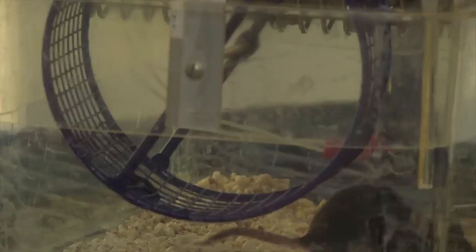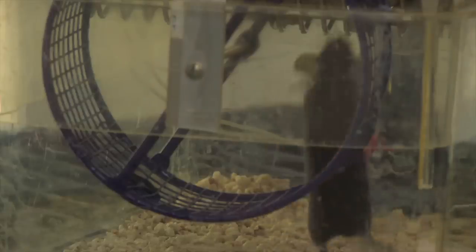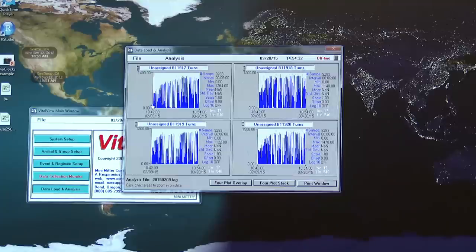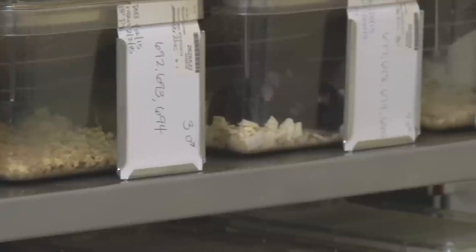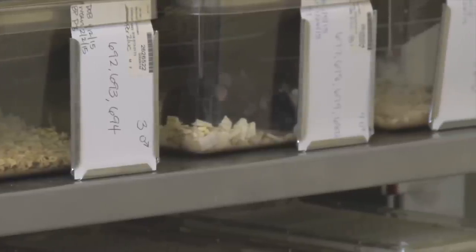It could also be that the mouse doesn't want to run for whatever reason, in which case sometimes very early in the experiment we can switch out a mouse, but generally it just means we might not include that mouse in our data. Additionally, a vet technician comes around every day to check the health and well-being of our animals, and we cage change the mice once every three weeks, changing out their bedding and water to make sure they have fresh supplies.